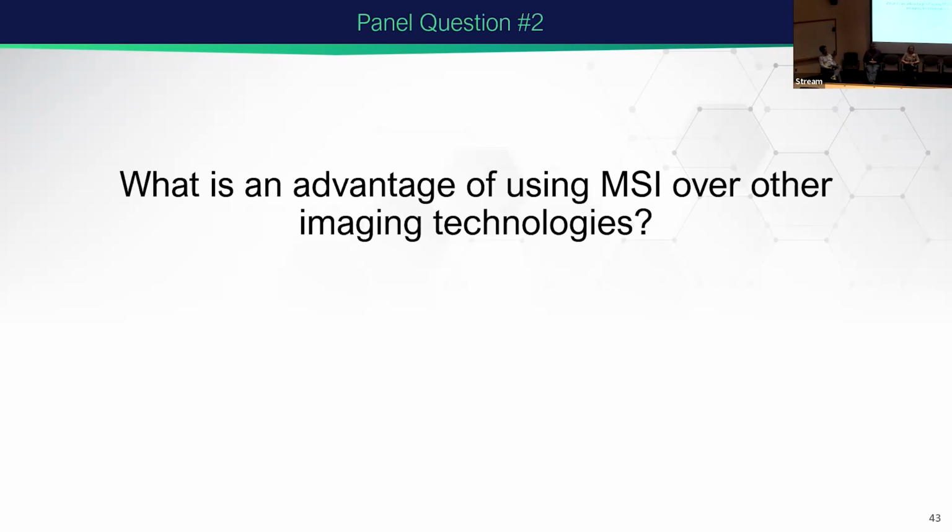Especially because in heterogeneous tissues, the intensity of the signal depends on the matrix. So if you have a really heterogeneous sample with signal that is higher in one part and lower in another, it doesn't necessarily mean that you have more here than there. It's just that the matrix here suppresses the signal there. So that's also one of the big disadvantages I find.